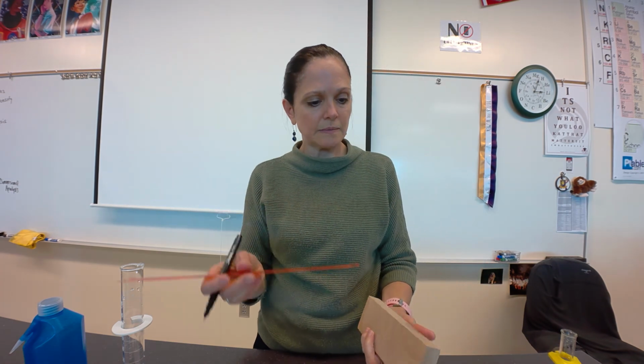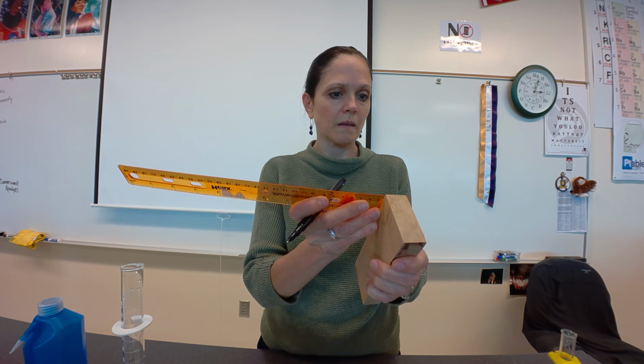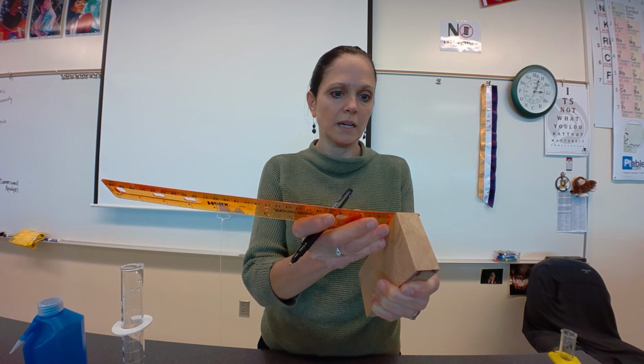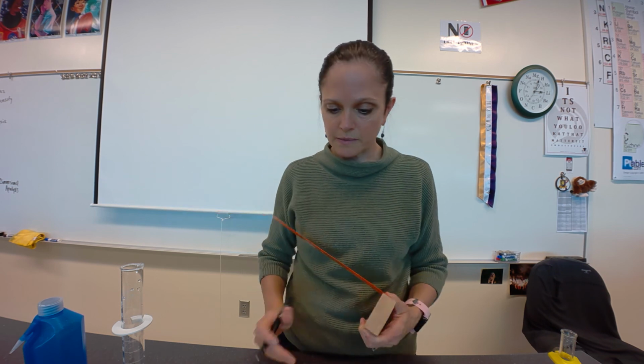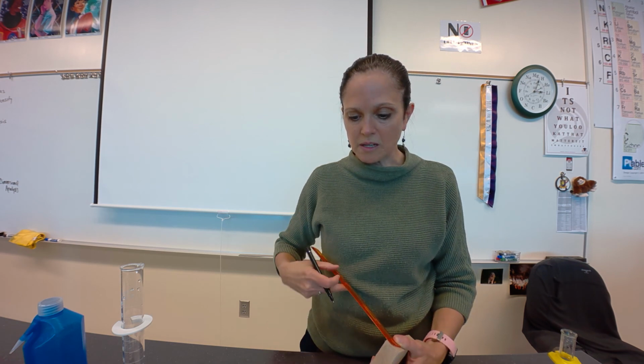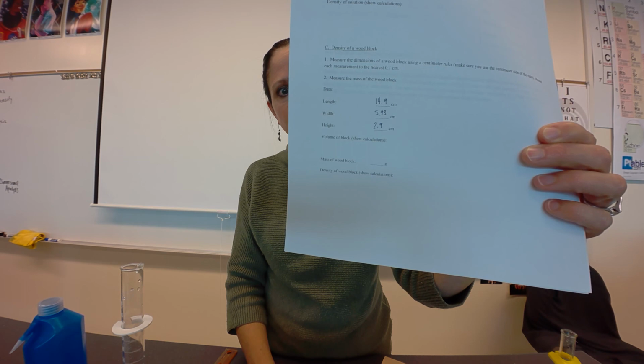And height, let's look at the height here. I have 2.9 on the height. 2.9 centimeters on the height. So just so that you can get those, I'm going to put those there.